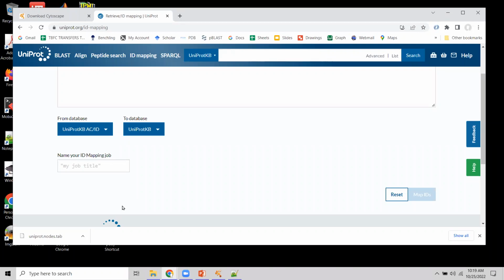If it's imported as .gz, you've got to uncompress it on the receiving end, on your laptop. Or import it as just a table, not the compressed one. So that's how it works. Let me try to reproduce the problem.